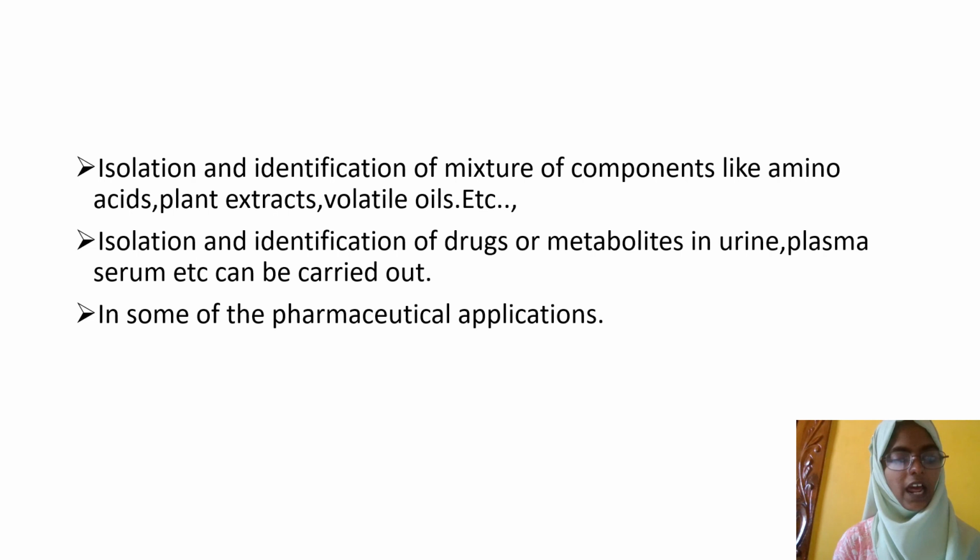Isolation and identification of drugs and metabolites in urine, plasma, serum, etc. can be carried out. In some pharmaceutical applications, we use gas chromatography.